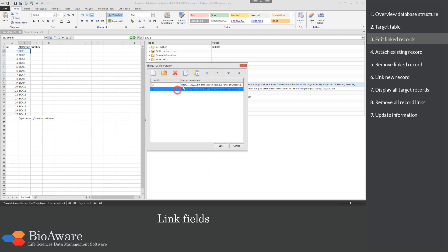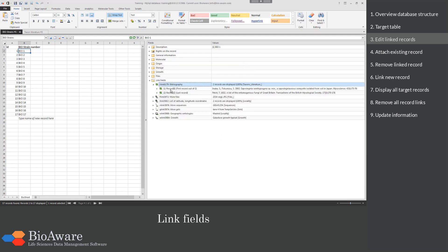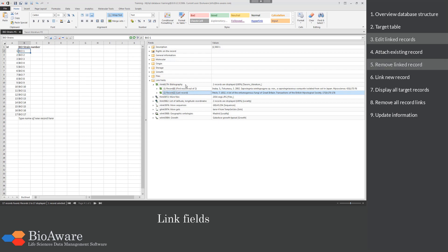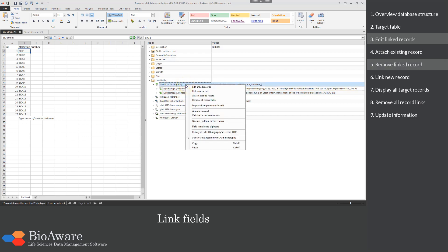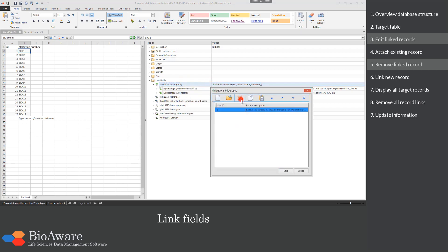It is possible to change the order using the arrow buttons on top. Now the bibliography field has two links. To remove a link, we can again go to Edit linked records, select the record from the list and click on the button Remove link.